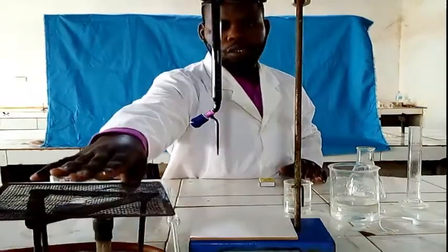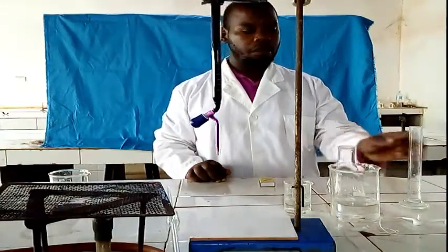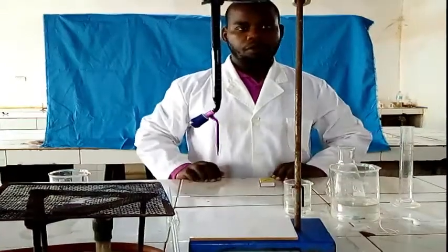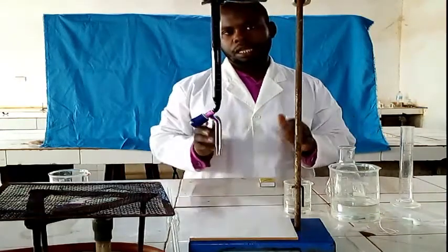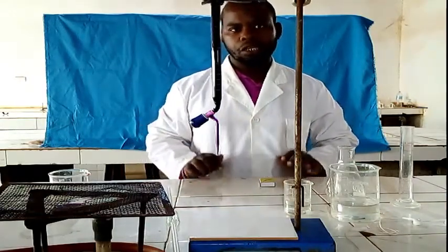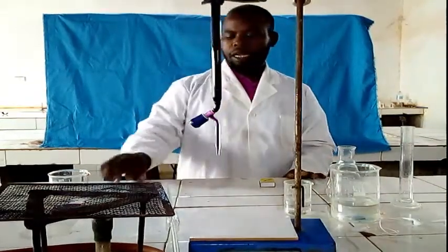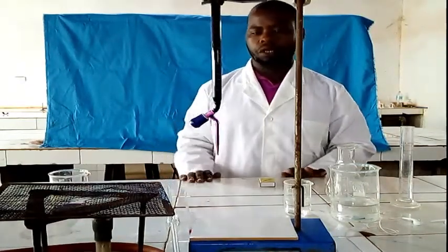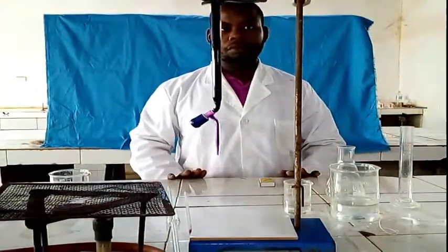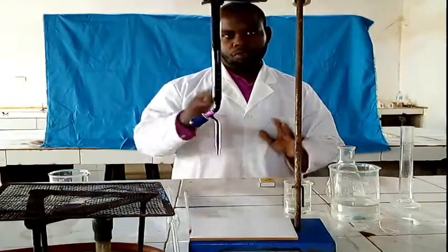We have a source of heat, a Bunsen burner. We have a conical flask for titration, and a measuring cylinder for measuring. So be with me step by step to understand these procedures, and you have to note the end point for this reaction between potassium permanganate and oxalate from oxalic acid. We also have a thermometer for measuring the temperature of the solution, because oxalic acid reacts with potassium permanganate at high temperature, so we have to heat it to speed up the reaction.